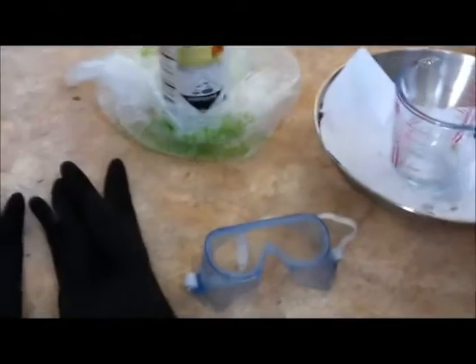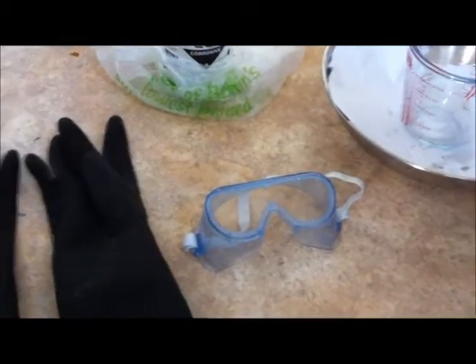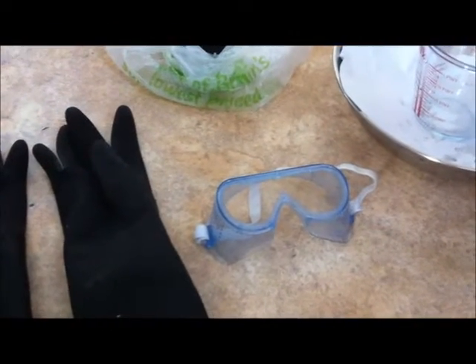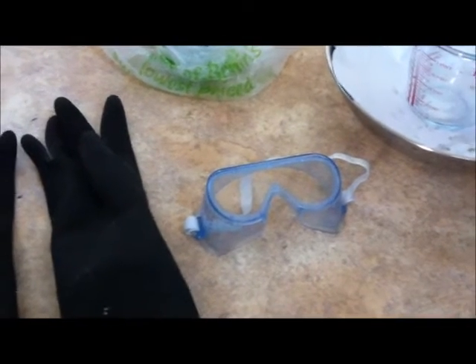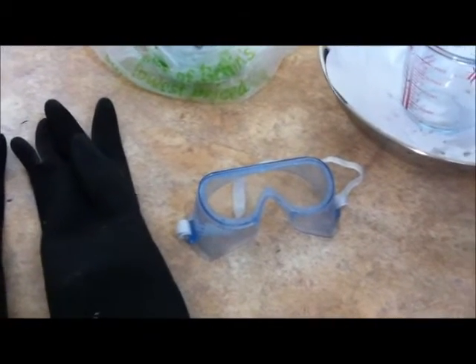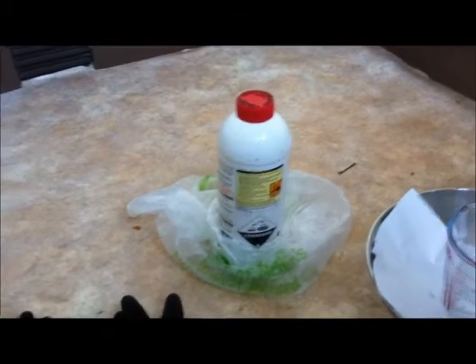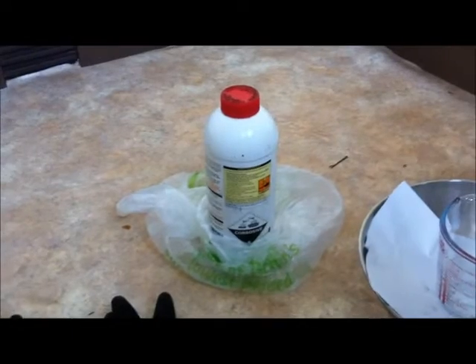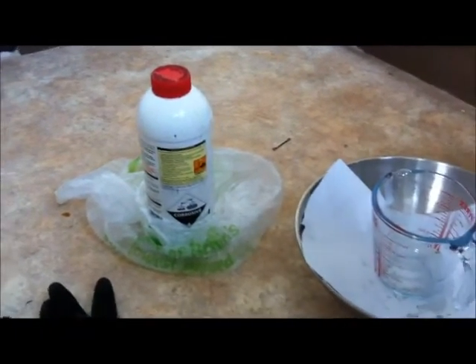Eye protection is a must. I've got a pair of goggles here - these ones I got out of an old chemistry set actually. I would recommend proper shatter resistant goggles. These ones will do the trick for this experiment I'm about to demonstrate, because some eye protection is certainly better than none when you're dealing with this stuff. If you get this stuff in your eyes, you will probably end up going blind. So do not skip eye protection.